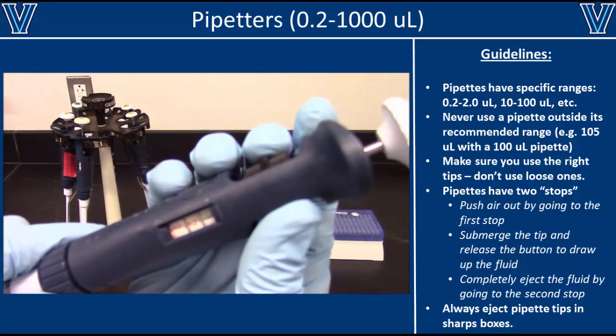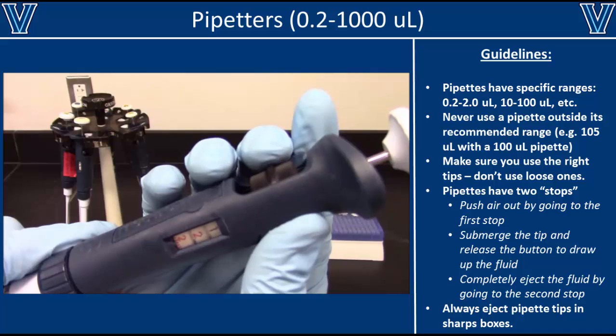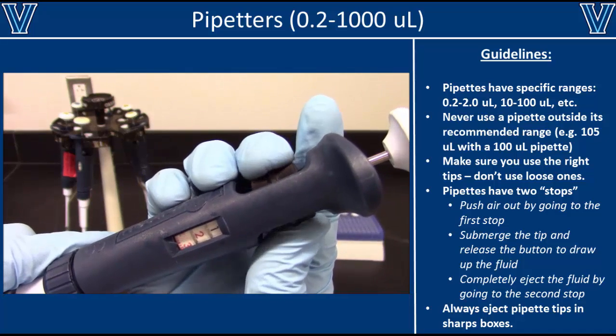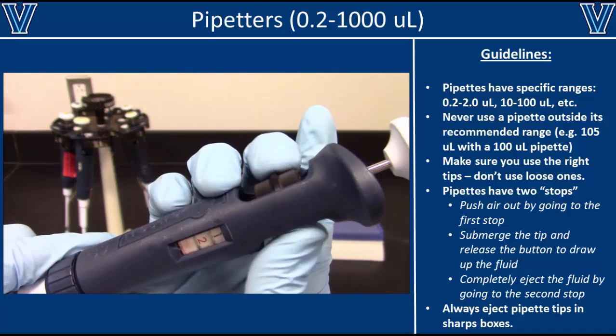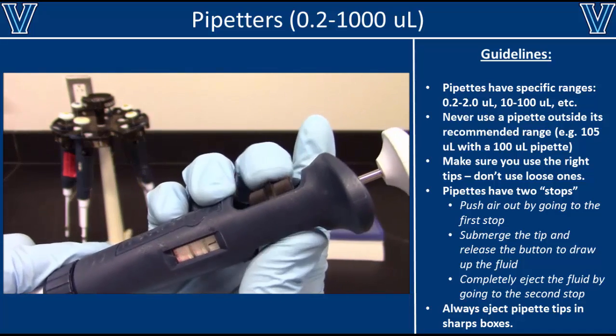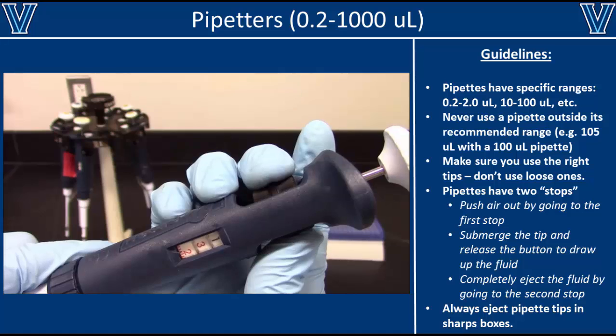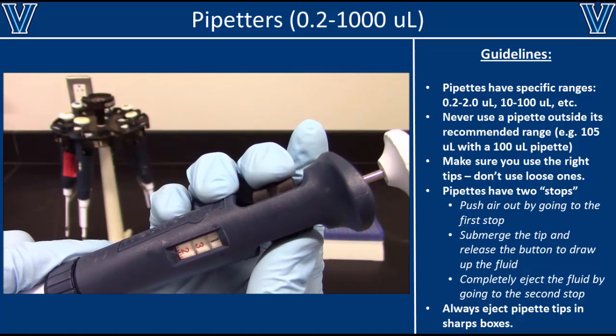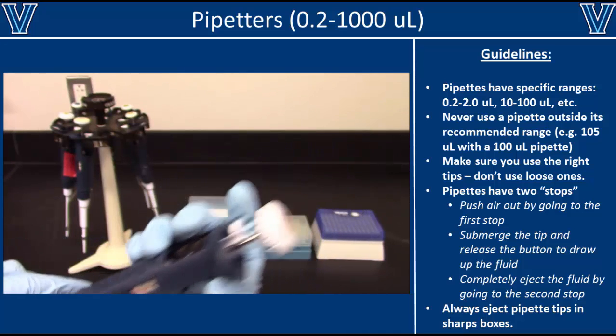On a P2 pipette, two of the digits are shown in red and one is in black for microliters. In this example, the pipette is currently set to 1.32 microliters.